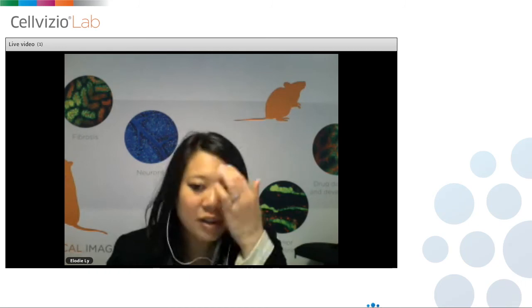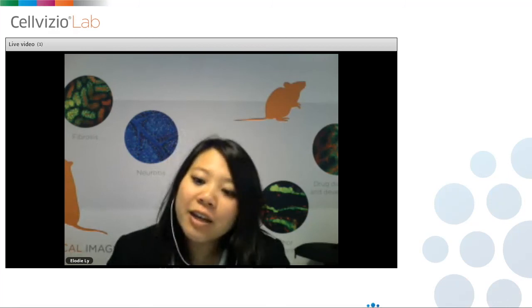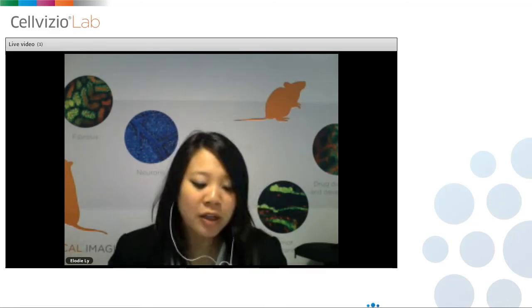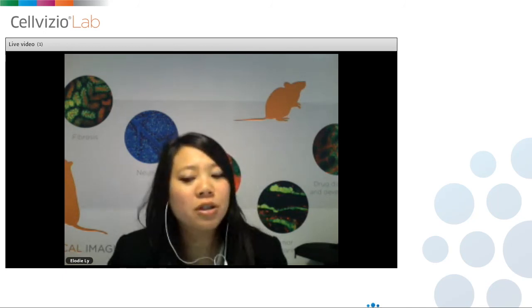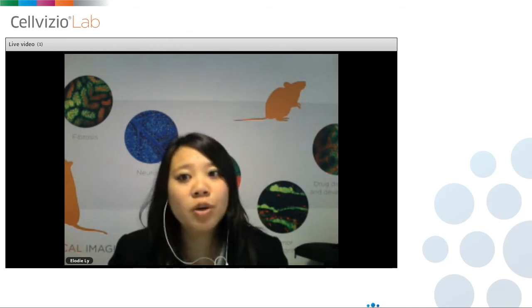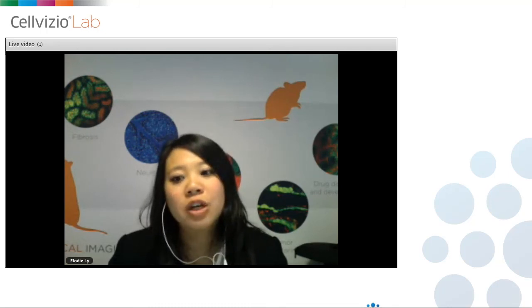I have another question still regarding blood flow. Are we able to measure blood flow? With our instrument, we are not able to actually measure the blood flow, but on the video we can see blood flowing. Note that the acquisition rate of our instrument is between 9 to 40 Hertz. So it will depend on what event you want to measure, whether it is compatible with our acquisition rate.